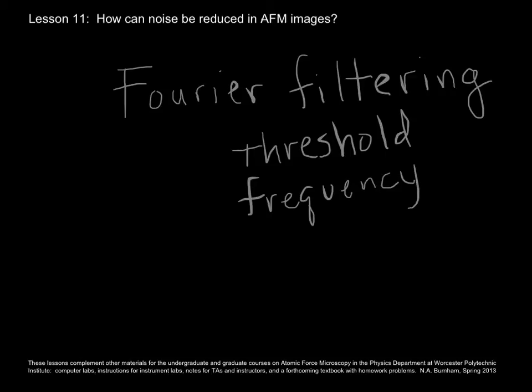And it's the same idea as we saw in noise analysis. You transform from the time domain to the frequency domain, and in the frequency domain you can see things going on more easily than you can in the time domain.